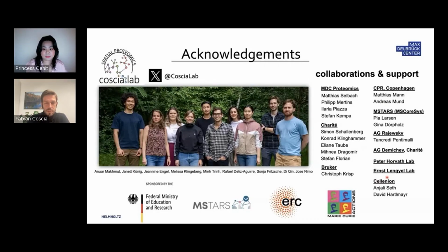Yeah, thank you very much for the question. If we look back at the last 3-4 years, we have really seen remarkable advances and improvements in mass spectrometry, in particular when we speak about sensitivity. So how many cells, how much tissue do you actually need for a deep proteome measurement? But also throughput has rapidly improved in recent years, and currently there is really no reason why these developments should stop within the next few years.